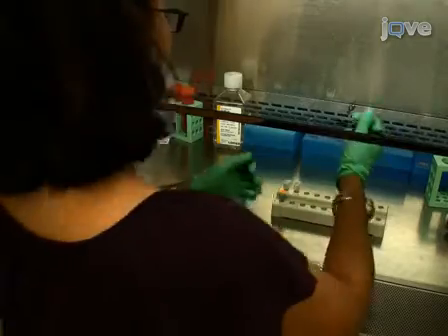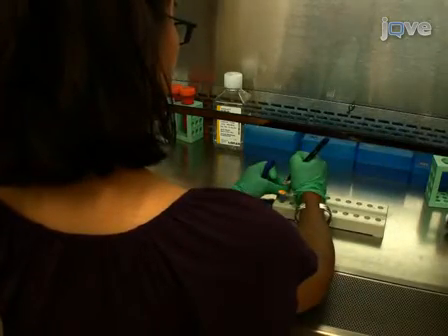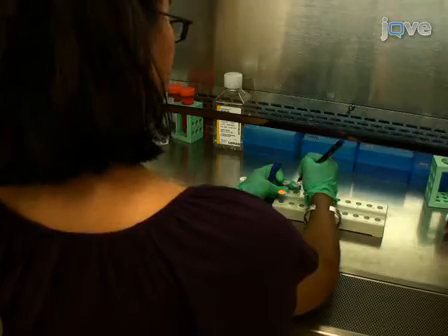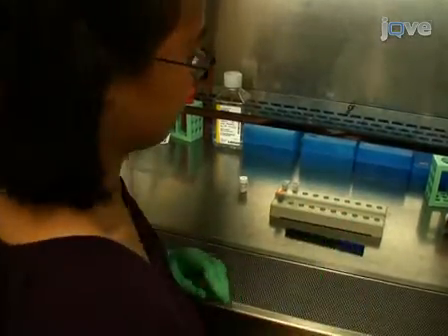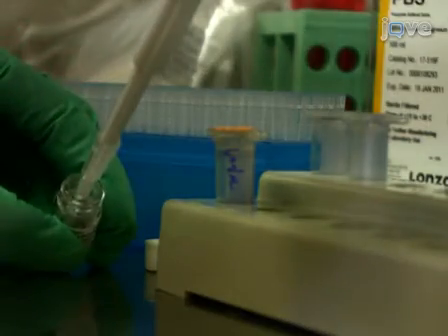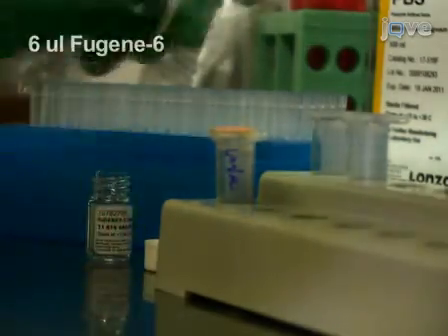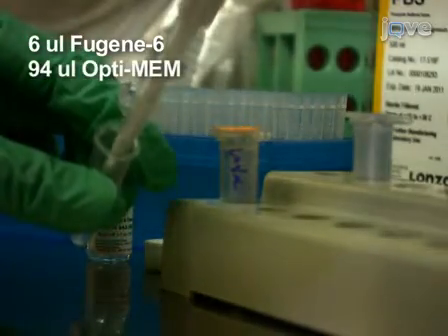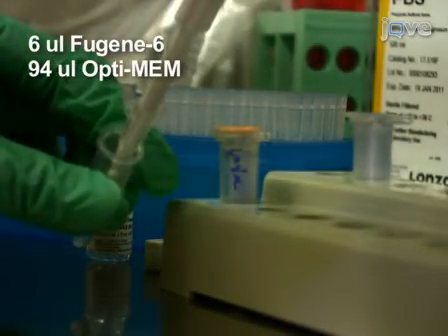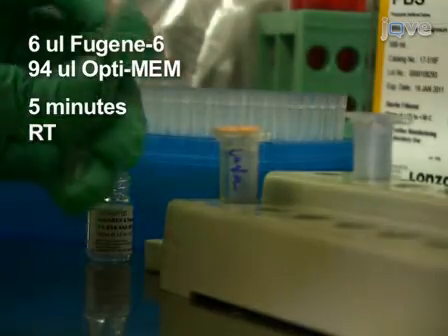While waiting for the Fugene to warm, label 1.5 mL polypropylene microfuge tubes for each plasmid DNA to be transfected. Being careful not to touch the sidewall of the tubes, add 6 µL of Fugene-6 to the tubes, which should already contain 94 µL of Opti-MEM media. Incubate for 5 minutes at room temperature.